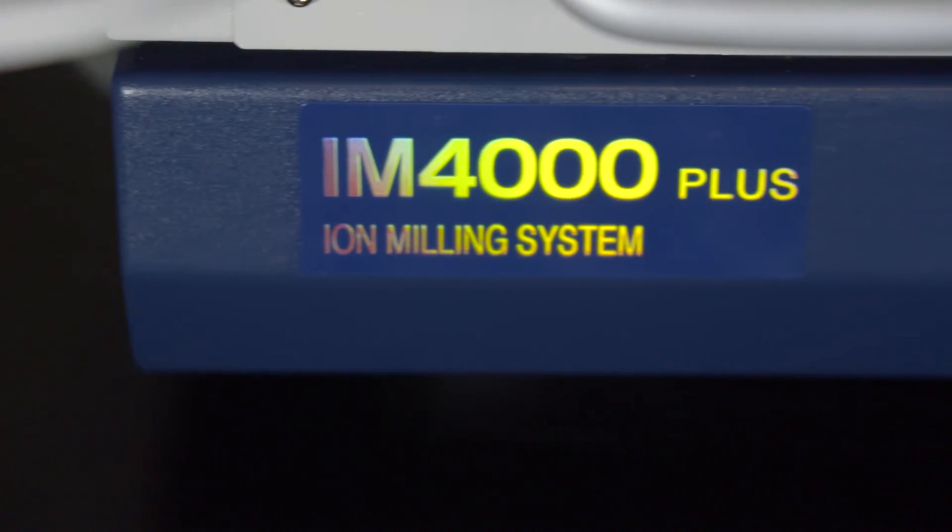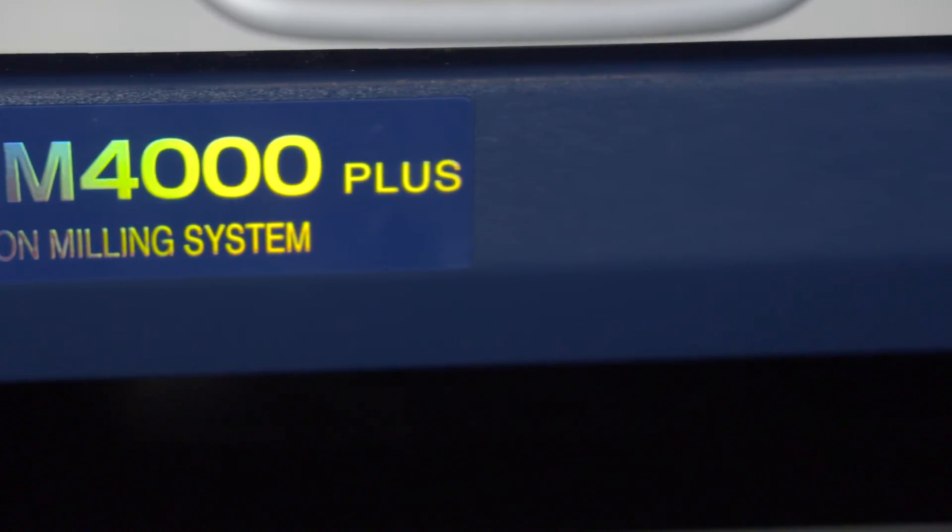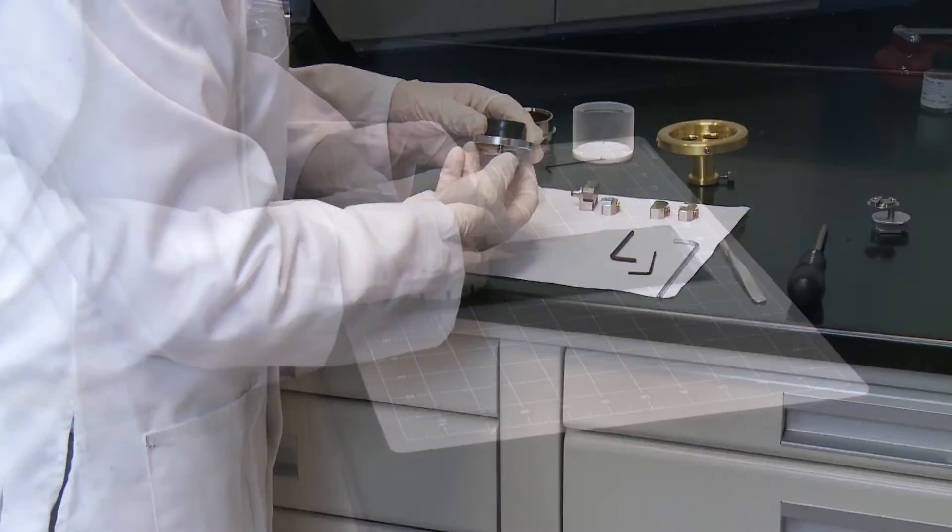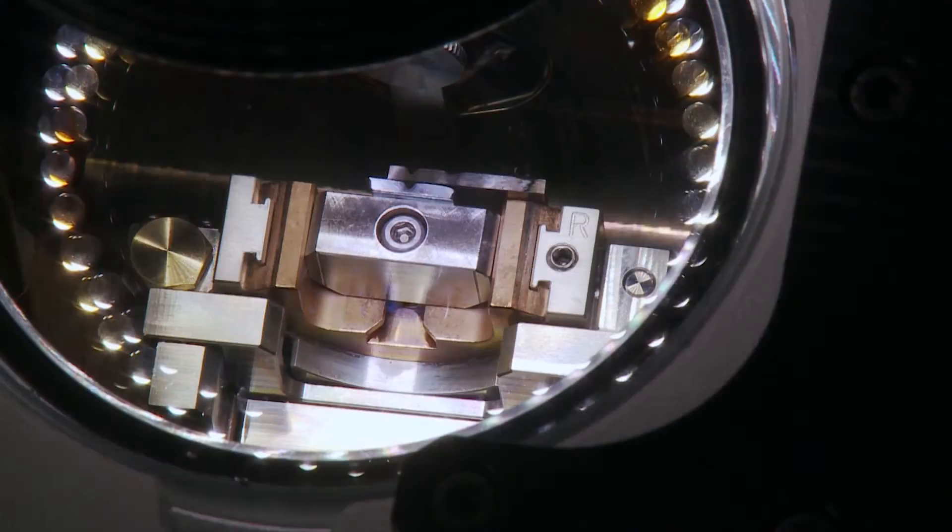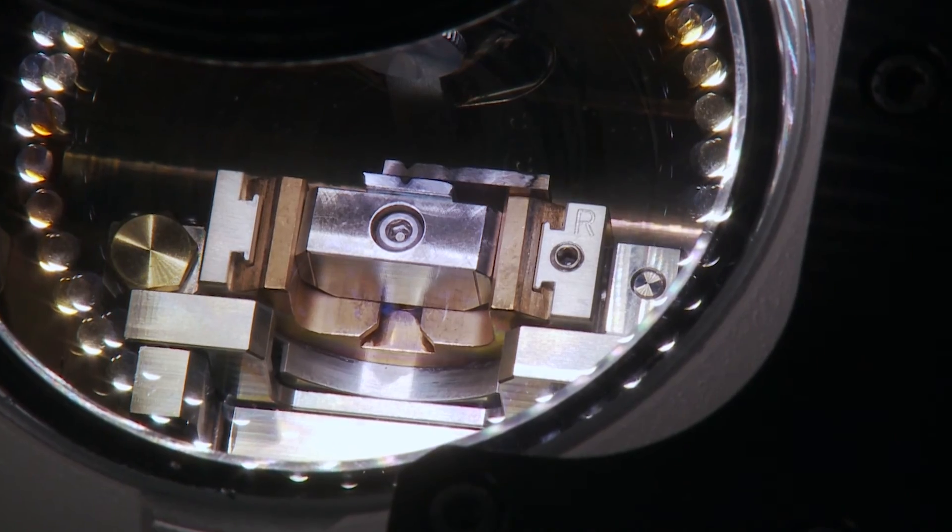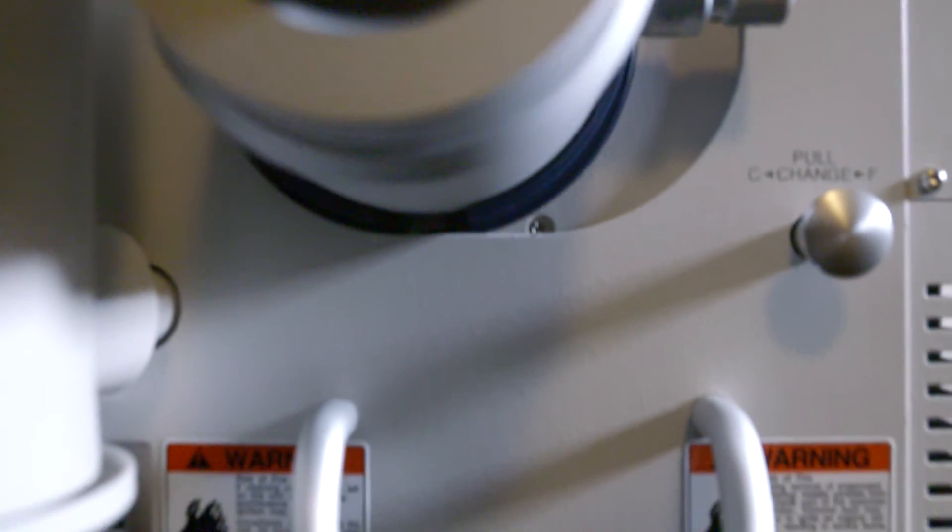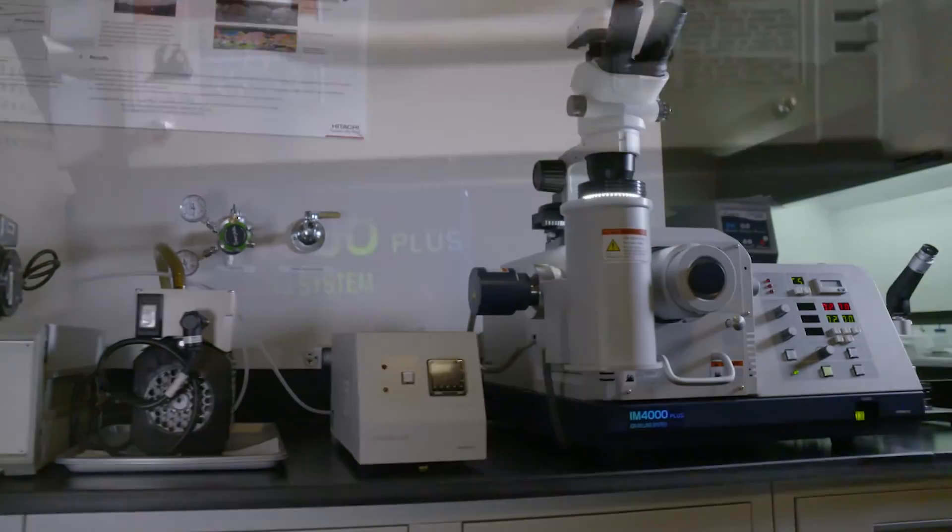The IM4000 Plus is a hybrid Ion beam polishing instrument capable of creating cross sections of samples and creating a finely polished surface by flat milling. The IM4000 Plus works to reveal the fine internal and surface structures of a wide range of materials.